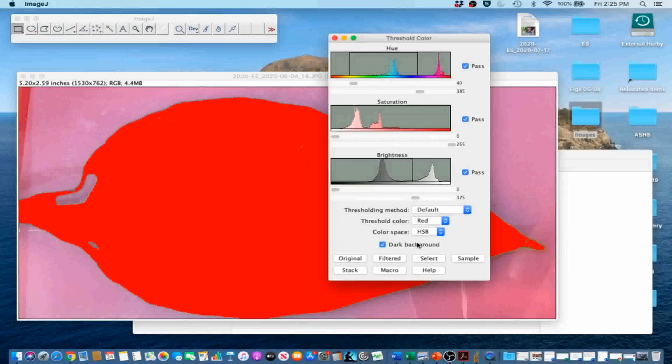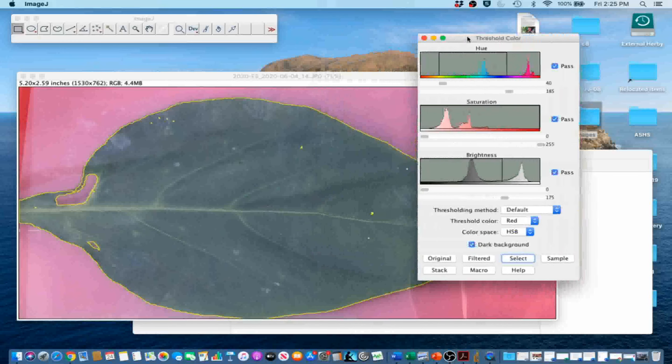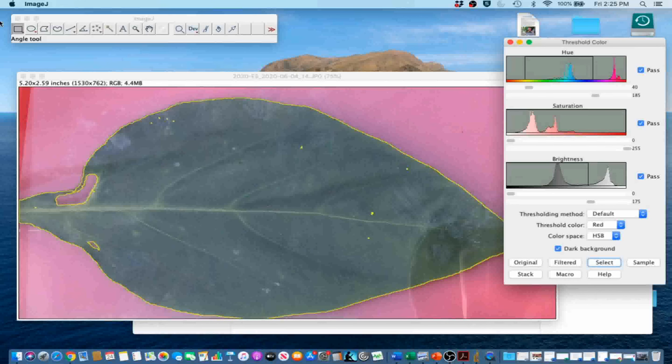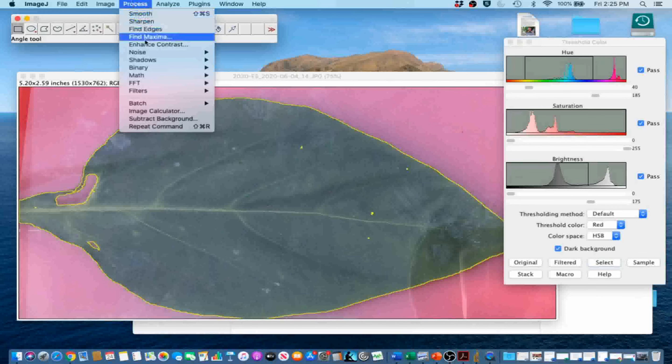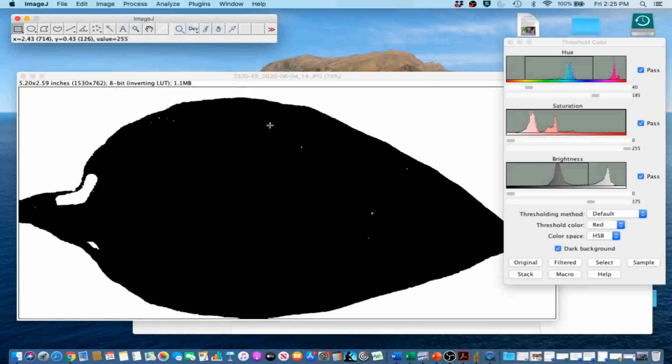Go ahead and click the Select button. Now we are going to go to Process, Binary, Make Binary to convert the color image to a binary black and white image.